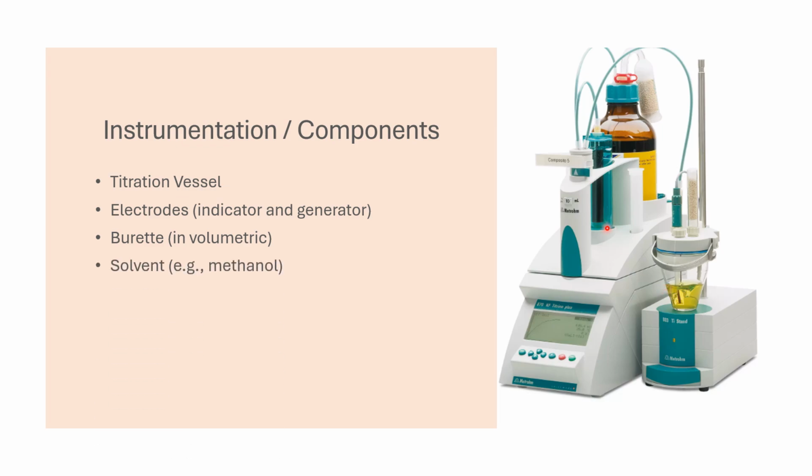Next one is the solvent. So typically methanol, that is dried methanol, is used to dissolve both sample and reagents, right? Next one is the Karl Fischer reagent. These include commercial solutions like Hydranal, right?